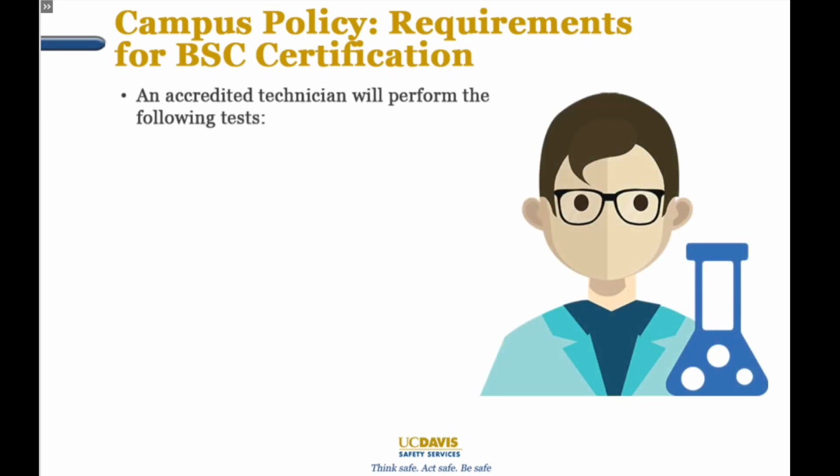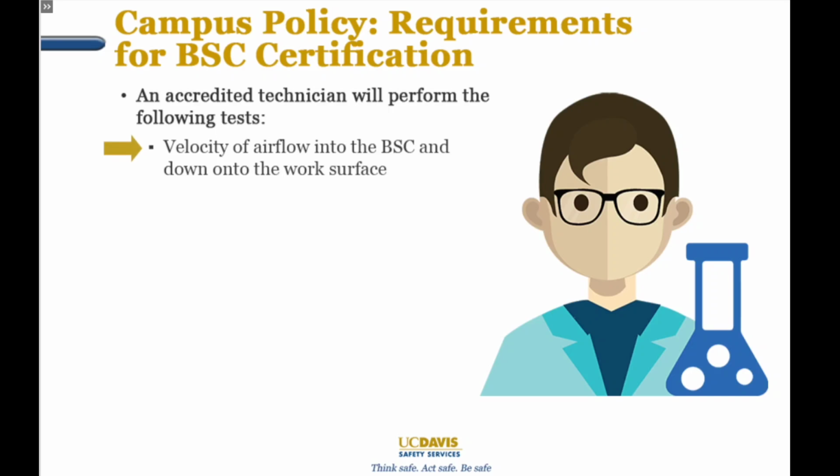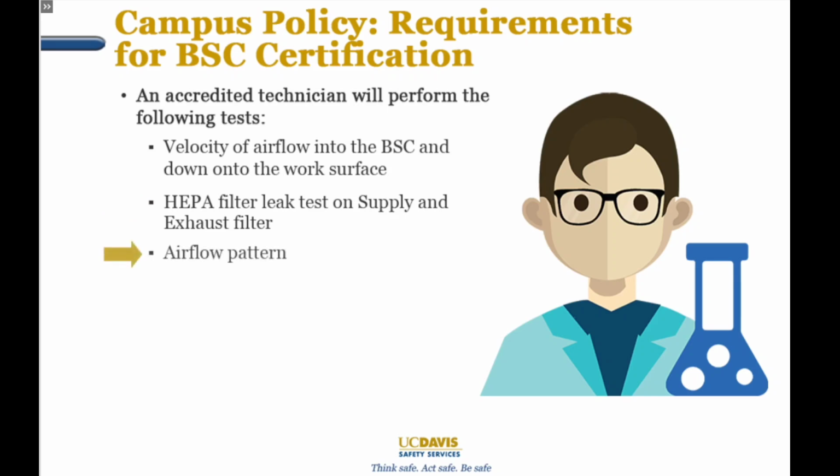The technician will perform the following tests: checking the velocity of the airflow into the BSC to make sure it is fast enough to maintain personnel protection, the velocity of air down onto the work surface, checking the HEPA filters to ensure that they still capture 99.97% of 0.3 micrometer particles, and airflow patterns within the BSC.